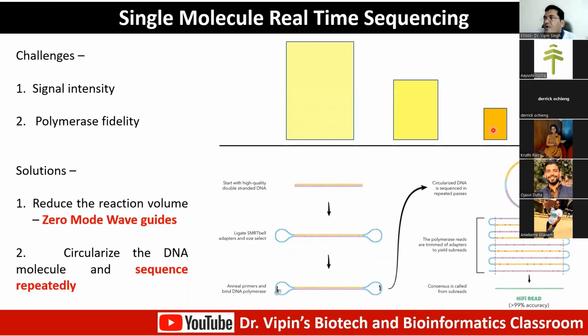Likewise, what SMRT does is to immobilize a piece of DNA polymerase and your DNA in a very small volume, which is known as a zero mode waveguide, right? And we'll talk of it as we go along. So these are very small spaces in which a single DNA polymerase is incorporated, and it is then provided with the DNA template that you want to sequence. Therefore, the intensity of signal is still good enough to detect because the volume of the space where you're doing the reaction is very small.